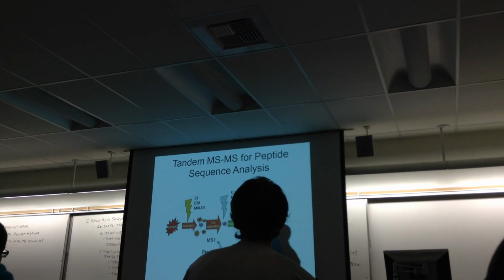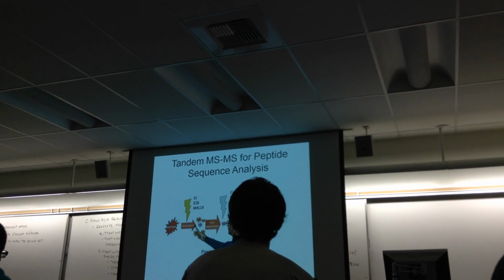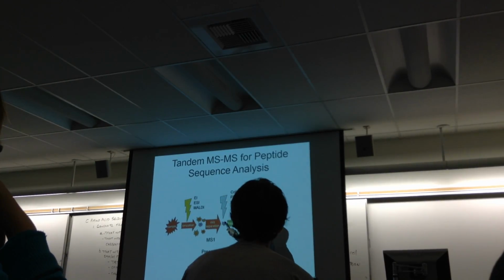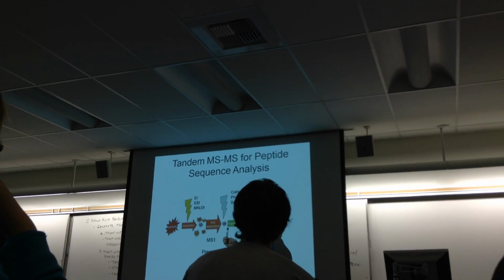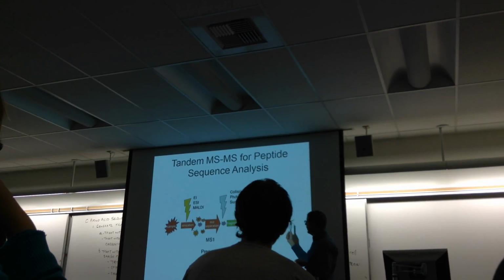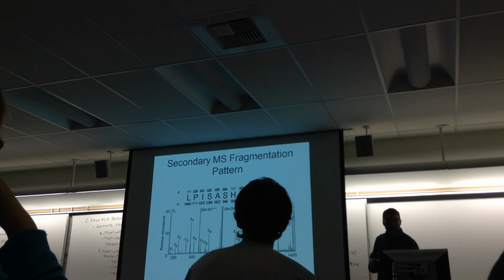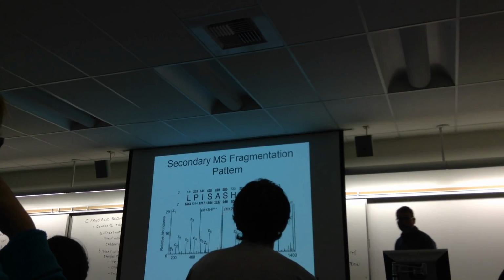You have your sample that has a bunch of different peptide fragments in it. You ionize it, then you separate those based on size, and then you collide them to take those separated fragments and further fragment them, and then you separate them, and then you detect, and then you have to do the deduction of the sequence. And so this is the complexity of what we're going through.